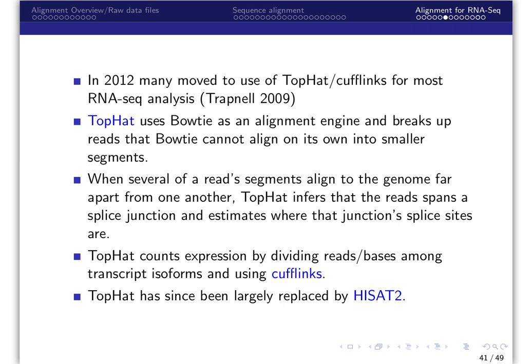After TopHat alignment, Cufflinks is then used to quantify the sum of all reads that map to a gene across exons and all intron splice junctions. Accurate de novo discovery of splice junctions requires very deep sequencing coverage because each splice site must be covered by multiple reads with adequate overlap with the exons on both sides to allow for alignment.